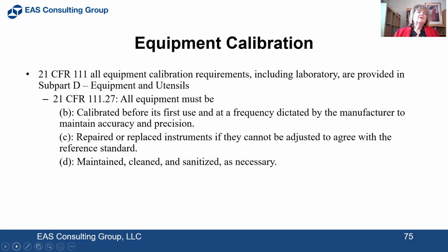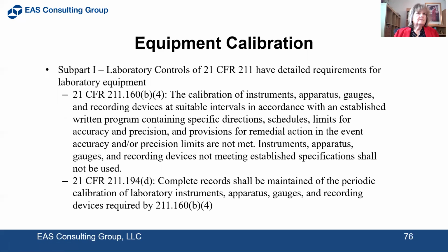So equipment calibration, here's the regulation for 111, and it's using the equipment utensil since there's not one in particular. 211 also has it. 211 just does a really better job than 111 of giving very specific instructions.